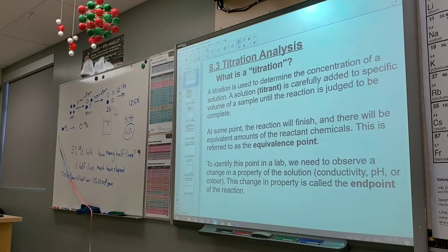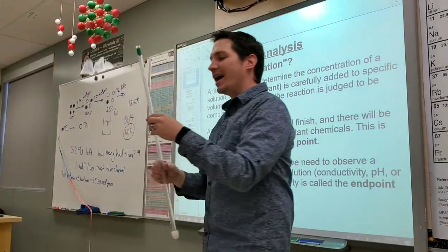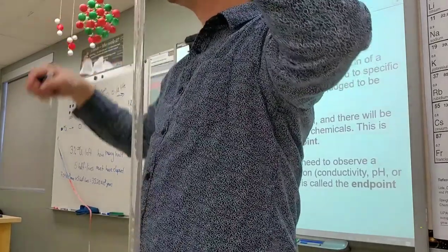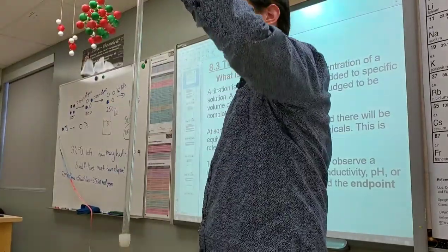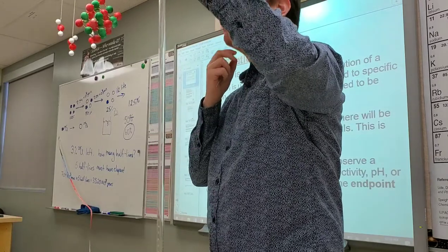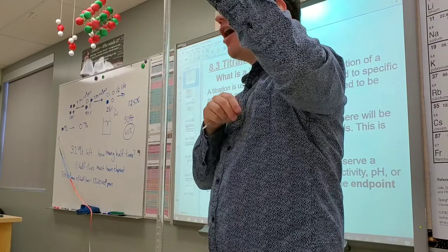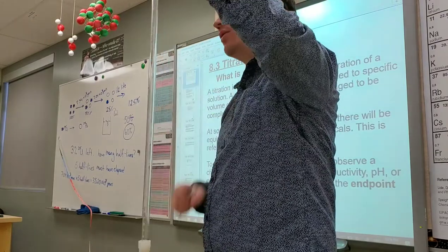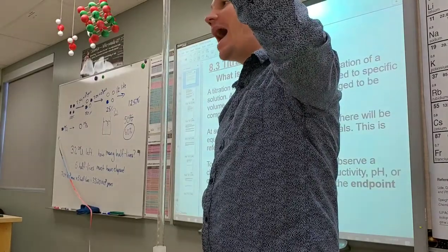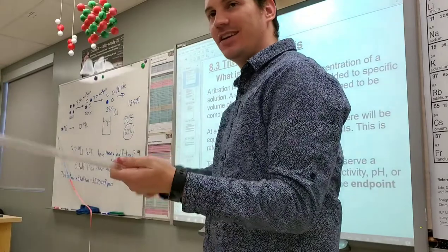So this is a burette, okay? It's a long, skinny glass tube, and it's got graduations the exact same way that a graduated cylinder would have them. This is one of our most precise volume measuring tools. This thing alone costs about $60. So it's not bad. It's not thousands of dollars, right?